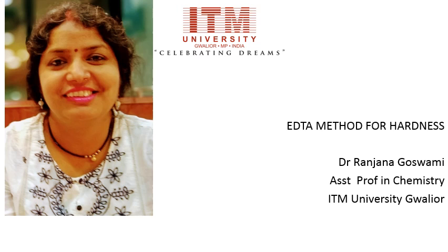In unit 1, we have talked about hardness and the degree of hardness, and how we can express the hardness in CaCO3 equivalent. Now we will see how we can analyze the hardness in the lab, and the method which is used to analyze the hardness in the water sample is called the EDTA method.